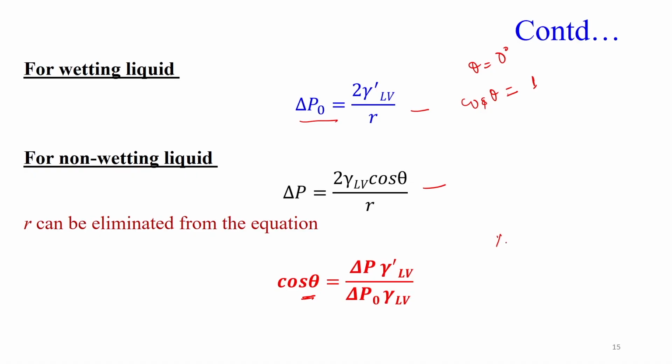So, here we say delta p is playing with the contact angle, and this method we use for powder samples, because with a powder sample we cannot put a drop of liquid and analyze it. So, for a powder sample we make a porous plug, we compress it and measure the delta p, and delta p is directly related to the interfacial tension and inversely related to the capillary radius.